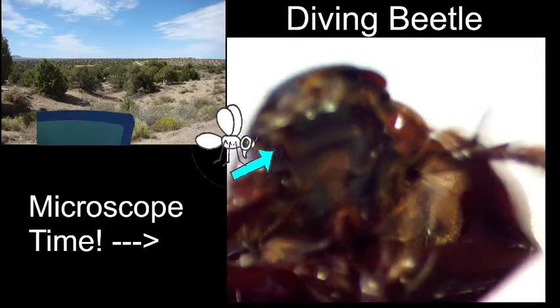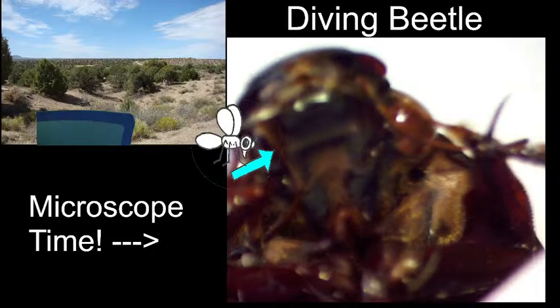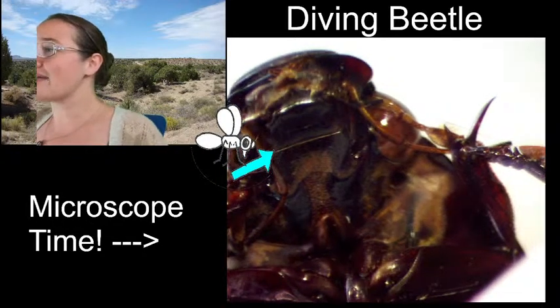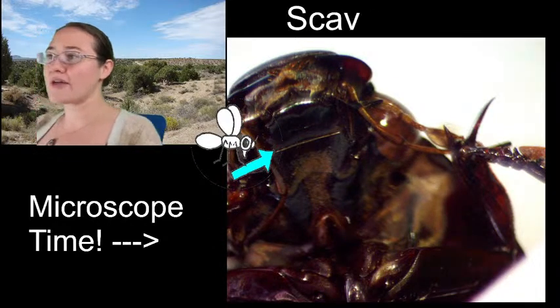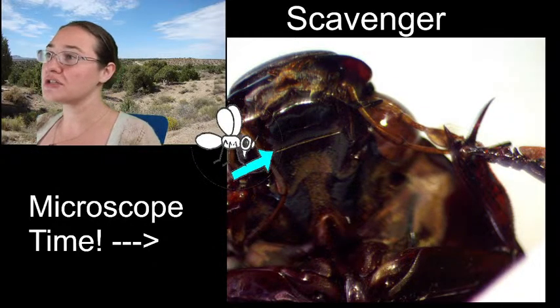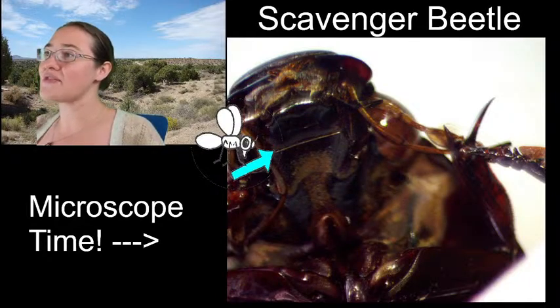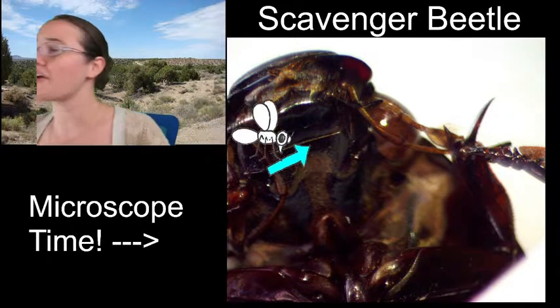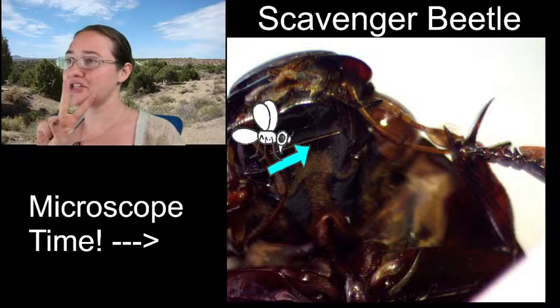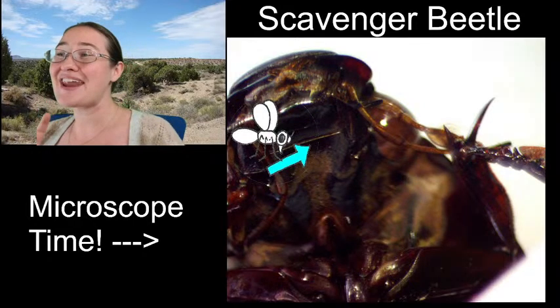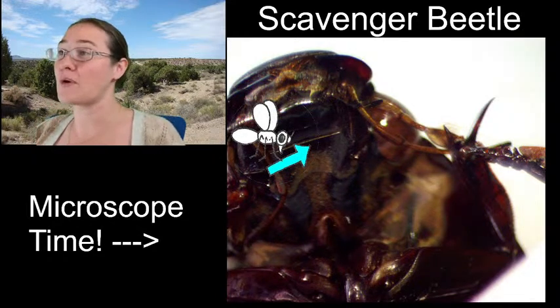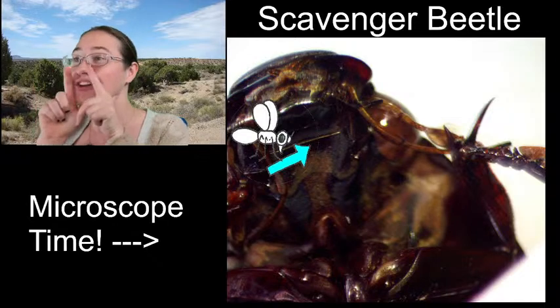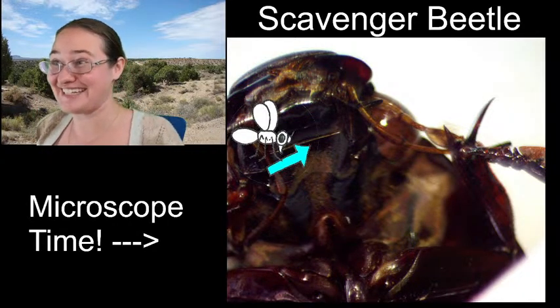Now I want to show a couple of really wild-looking characteristics on the head of this beetle. This is not the diving beetle we've been looking at — this is the water scavenger beetle, in the family Hydrophilidae, meaning water-loving beetles. Two characteristics to see: one, their antennae are actually clubbed and not filiform, and two, their labial palps or mouth fingers are longer than their antennae.